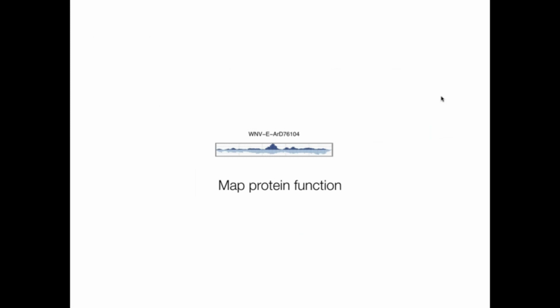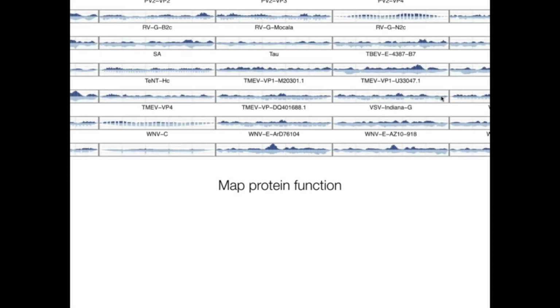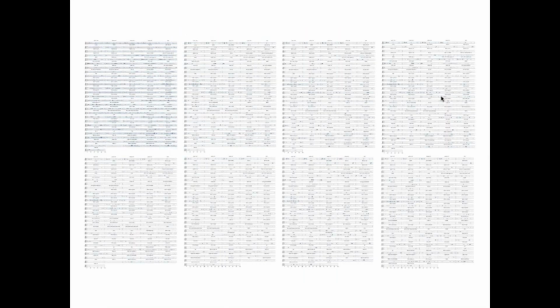So in the light blue, in the bottom, you can see the local transduction in the injected site, and dark blue is the transported function of the capsid. So we could start to look at specific hotspots in the proteins, that if a peptide is coming from that area, if we could induce a new function on the AAV. And with 3 different regions and 117 proteins, we ended up with tons of data to analyze to find these unique variants that have a specific function.